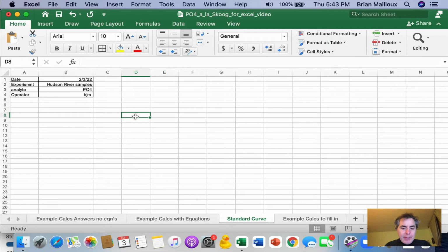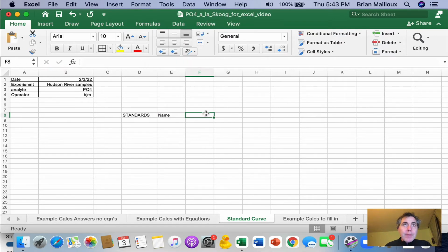So I'm going to start by adding our standards. We're going to have our name. It's a little bigger. We're going to have our actual standard. This will be our X, and our Y will be our absorbance. Then we're going to have standard 1. Let's see if this will fill in for us. Sometimes it will. Yep. We're going to have 6 standards.